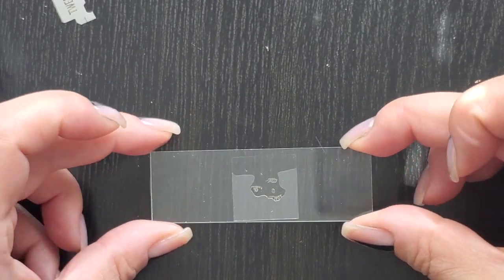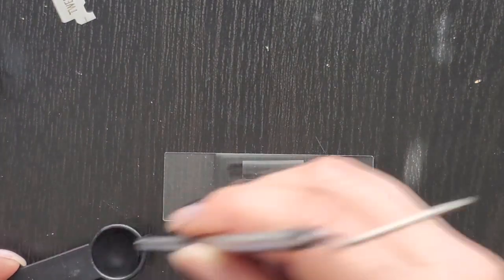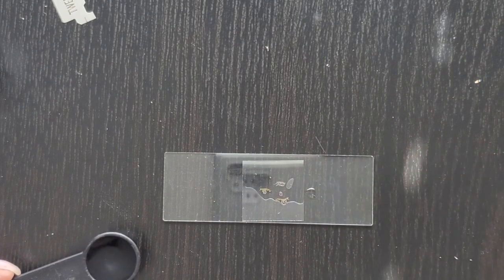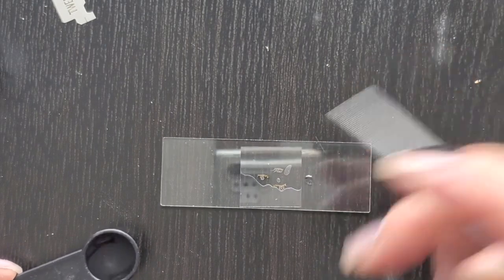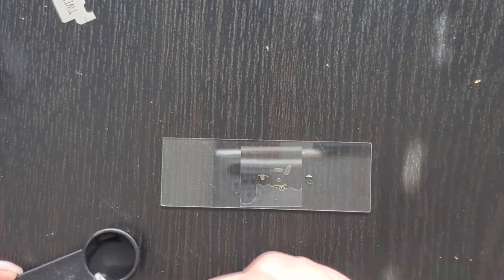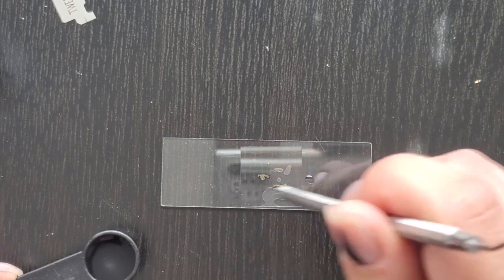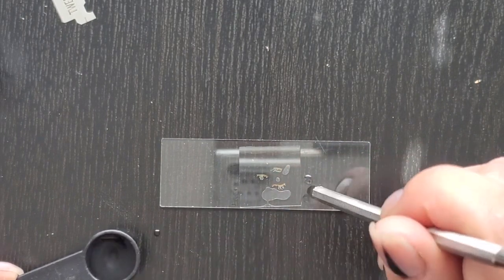So these should be good enough, but let's just add some more water to the glass slide. Otherwise, with the heat of the microscope, it'll start to dry up and it moves our gills around under the scope. So we're just gonna give it some water. And we don't want to squash down. You can do the squashing method later on.